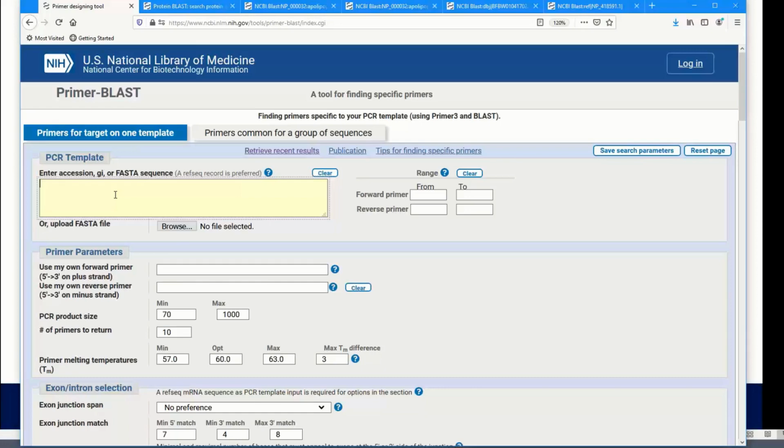Great. Before we go on to more of the direct applications, a person just wrote in recently. So if you have an accession, but you want to just look at a query range, since you're on this page, how would you identify a query range? Well, on this page, you would do that by just putting in the range that you want. Does that make sense?